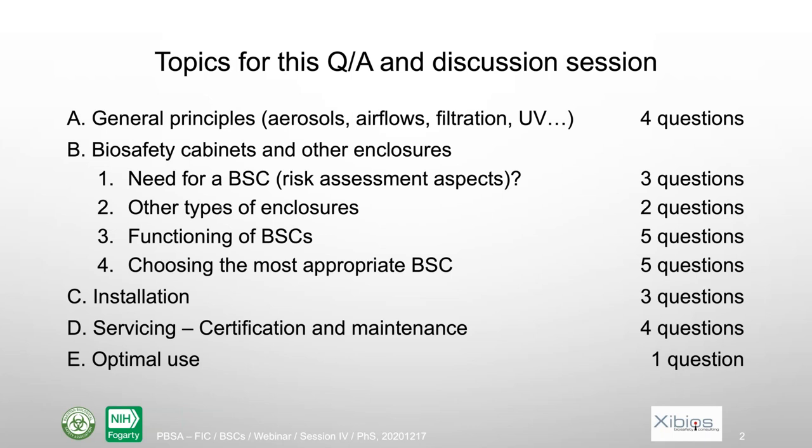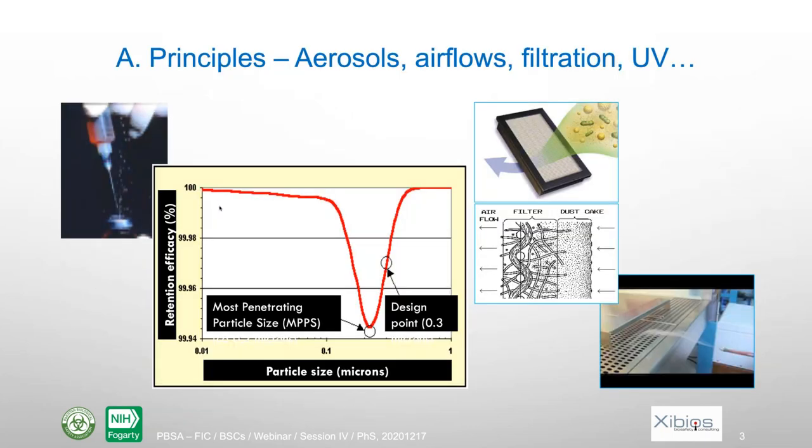There are some questions that are absolutely complementary to what was provided, but I also kept some other questions that were covered during the session, but perhaps not completely enough, or also because it allows me to insist on some very important points. So it's also a matter of conclusion of this webinar. So the first part is on the principles that are needed to really understand how a biosafety cabinet works.